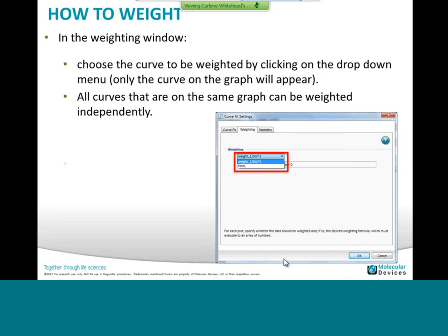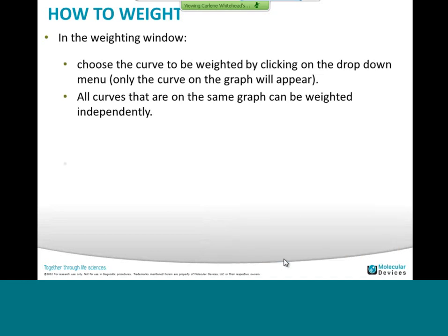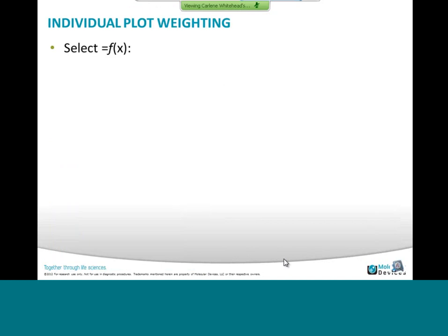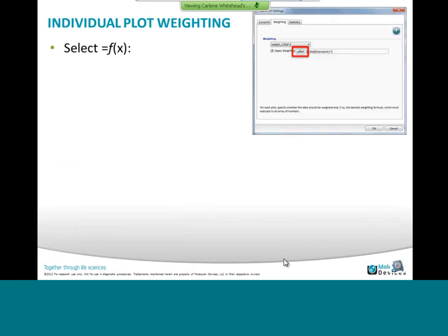Each curve on the graph can be weighted independently. Once you have selected the curve to be weighted, you select Apply Weighting and click this little fx.